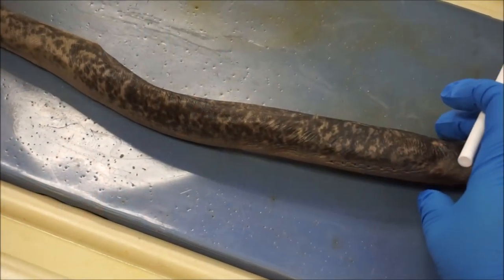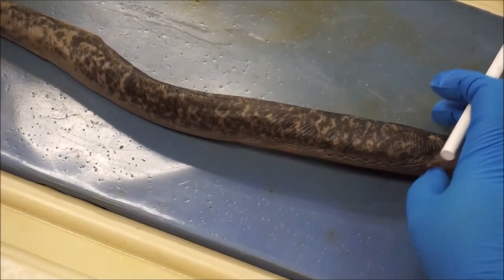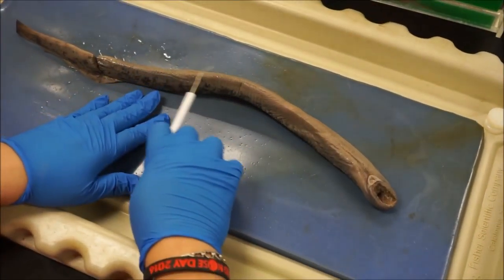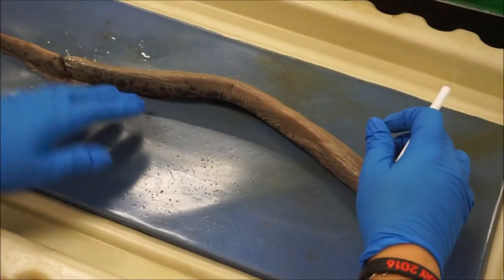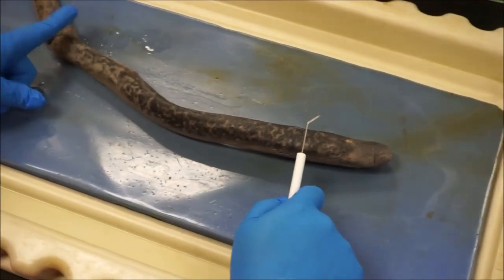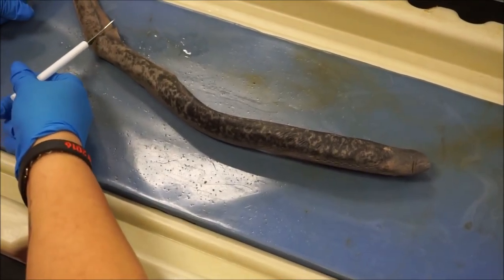And that's our lamprey. We named him Billy Bob. He's a boy. If you look at the ventral side, there is no opening down here like in the female. Here we have our head region, our body region, and our tail region.